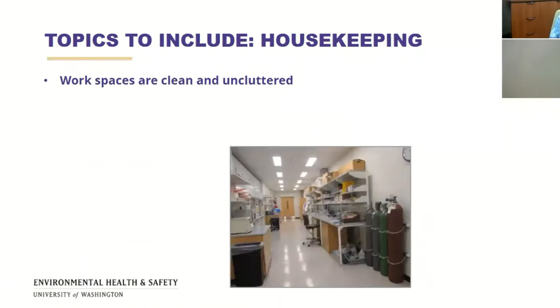The chemical hygiene officer or lab manager is never the housekeeper for a lab. When you review housekeeping practices in your lab, it is a good assessment of whether lab policies and practices are effective and being followed by everyone. If you find housekeeping issues, then you may want to review what your lab policies are, update them, and do a training for your group.